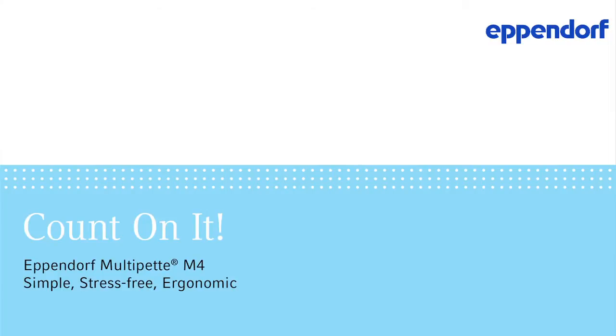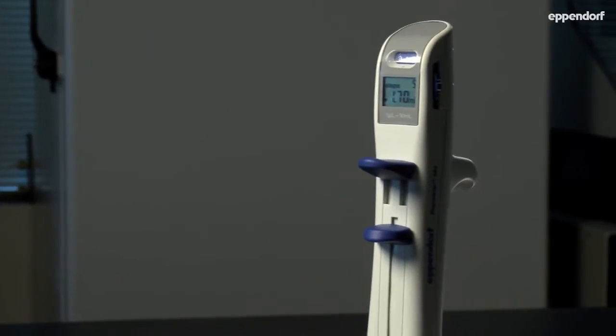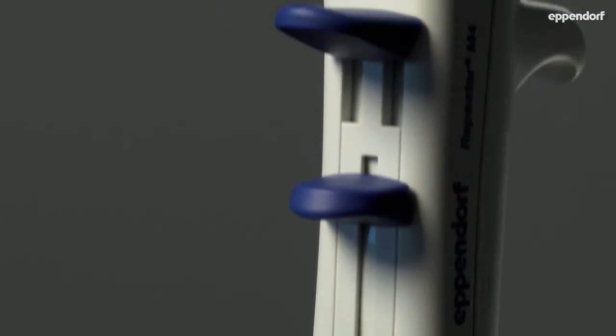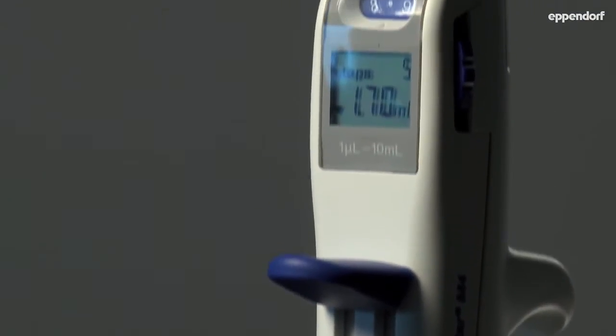Change the way you think about sample dispensing. The all-new Eppendorf Multipet M4 offers a simple-to-operate, ergonomically designed tool that makes long pipetting and dispensing series fast and easy.